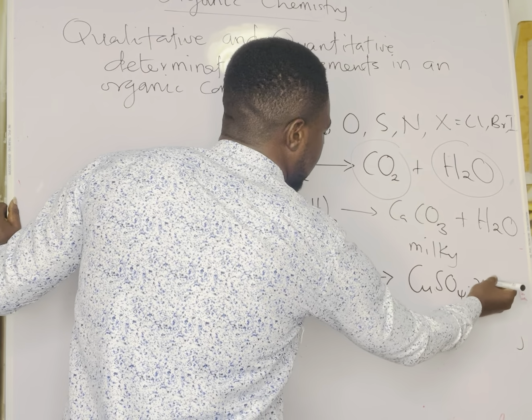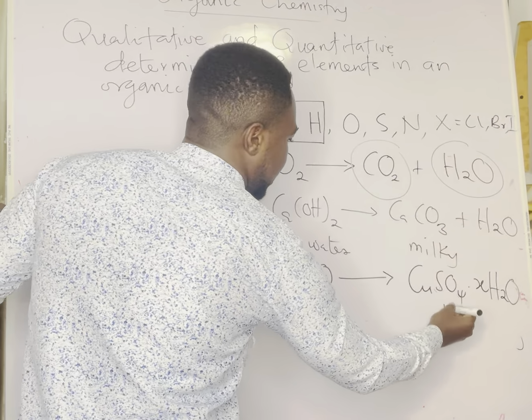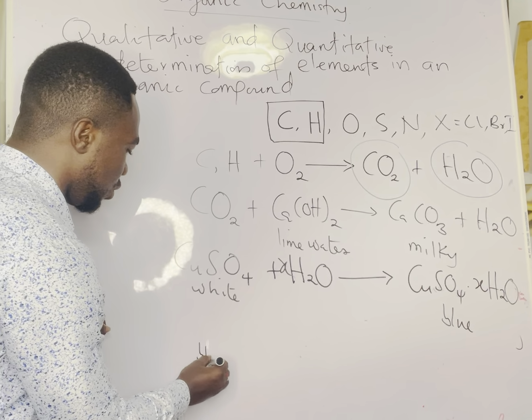blue color. So the water of crystallization, say X, this is blue. Or you can use blue cobalt 2 chloride.